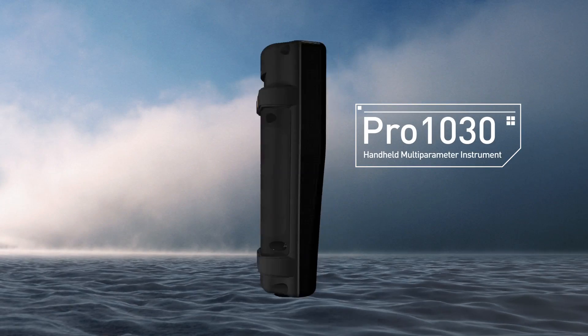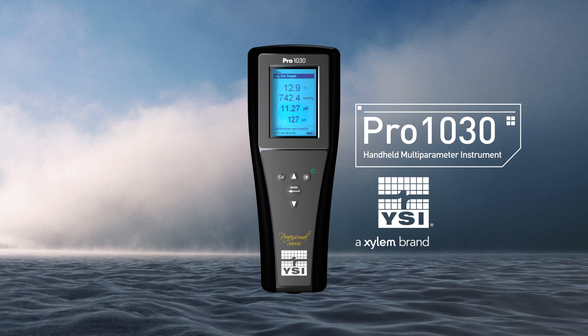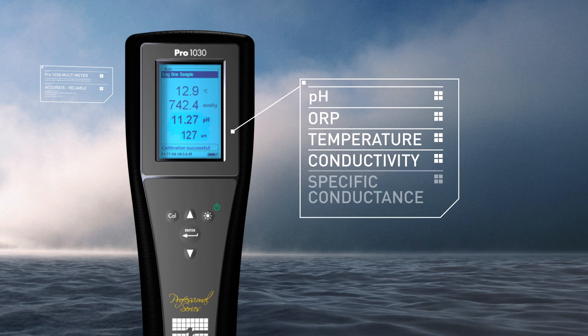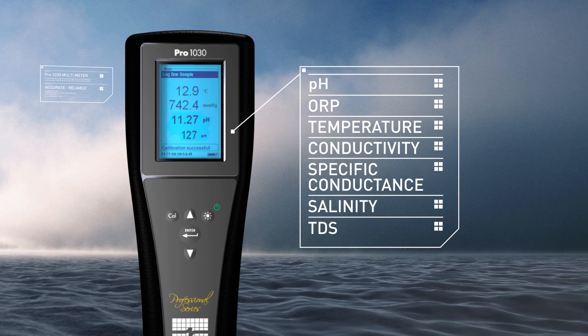Rugged and reliable, the YSI Pro 1030 provides everything you need in a handheld instrument for the measurement of either pH or ORP, along with temperature, conductivity, specific conductance, salinity, and total dissolved solids, TDS.